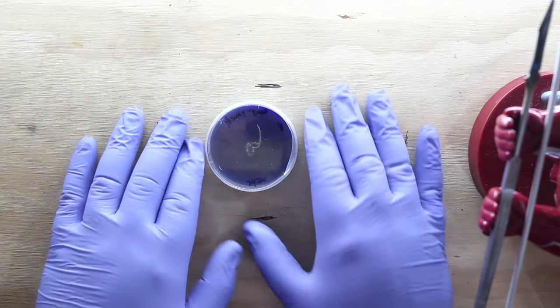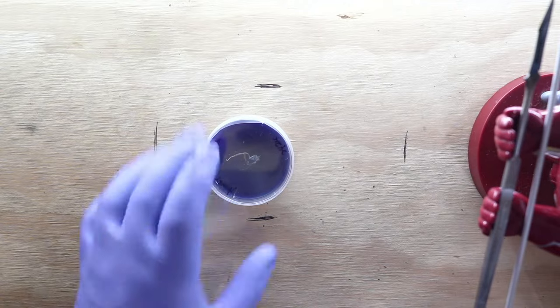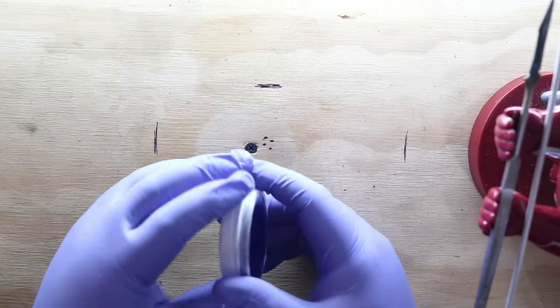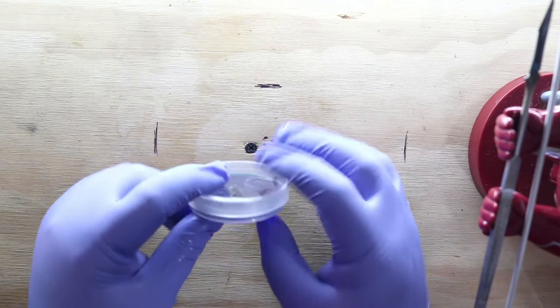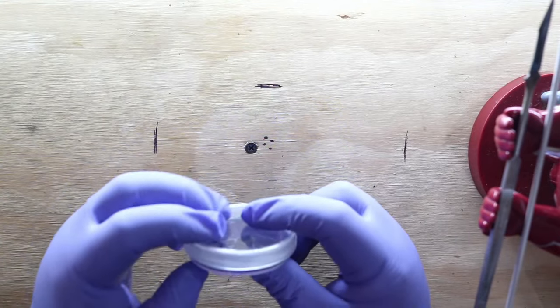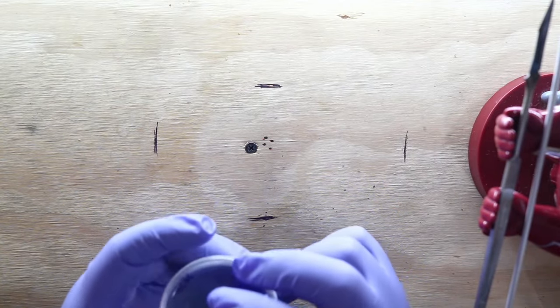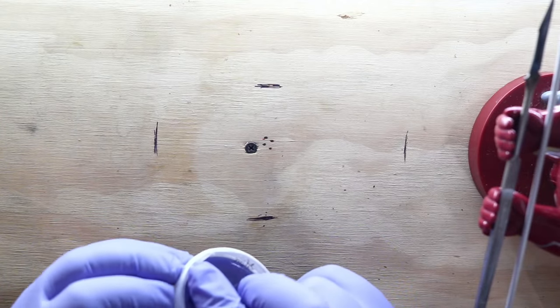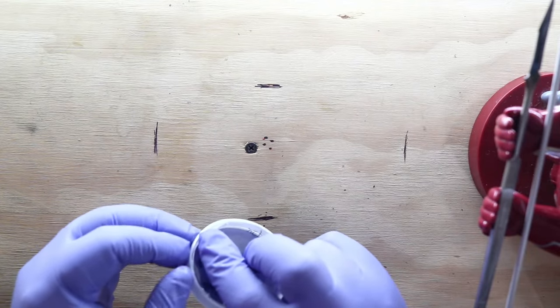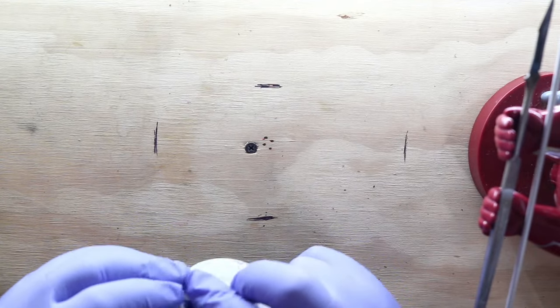All right. Here is some honey mushroom. I'm going to give it a little spritz of alcohol, just because this dish has been sitting around for a while. My flow hood is that direction. It's my Iron Man. One of my employees bought that for me, Tristan, my former employee, who ended up becoming my friend. He bought that for me before he left, because he knows I like Iron Man.